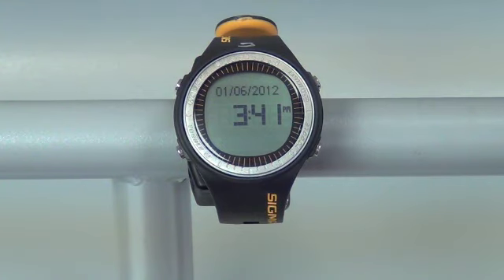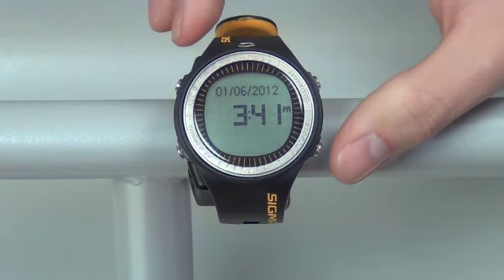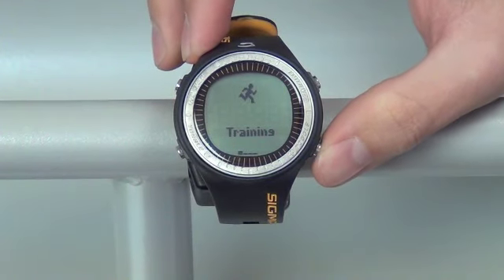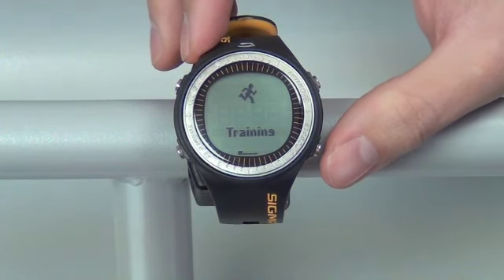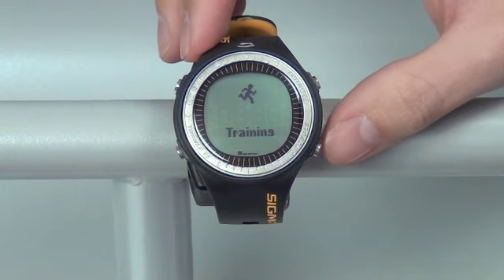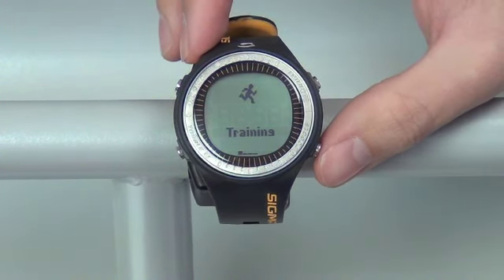To wake your PC2510 from sleep, push any button and hold it for two seconds. You're now at the main menu of your PC2510. You'll see in the bottom of the screen four dashes representing different screens which you can navigate to from your main menu.